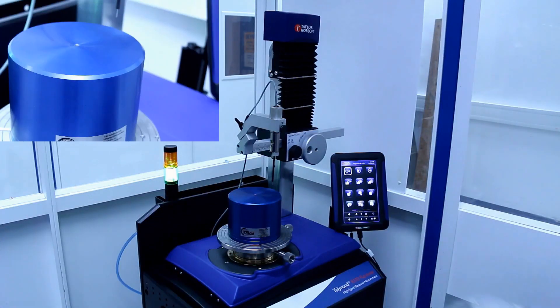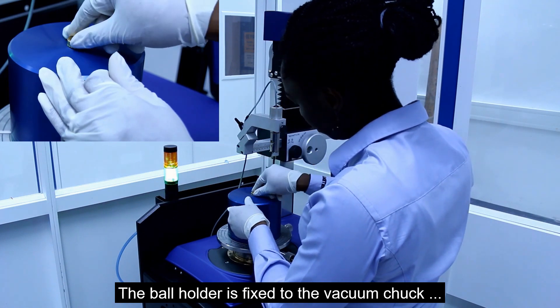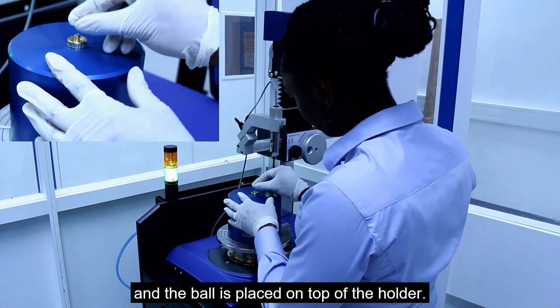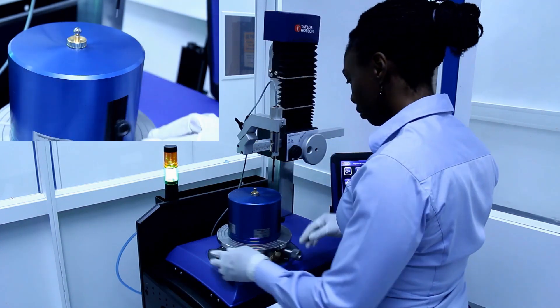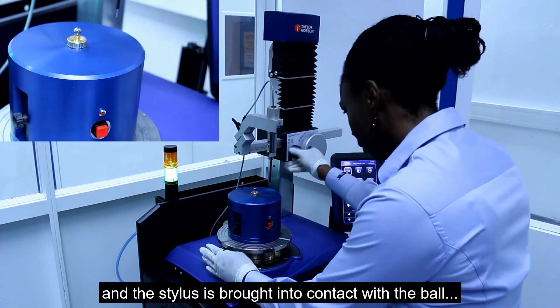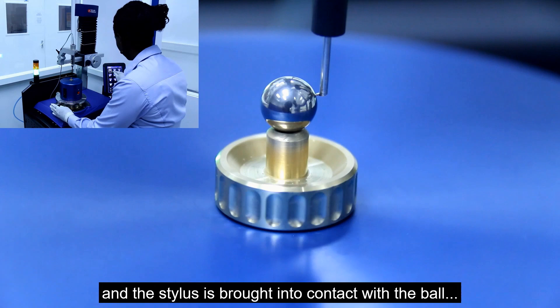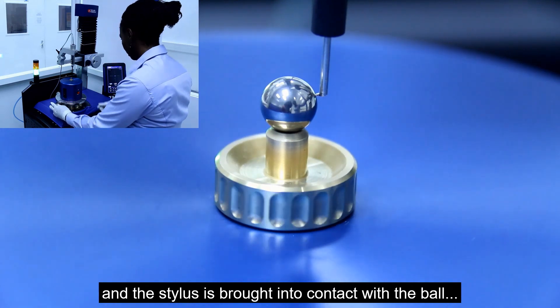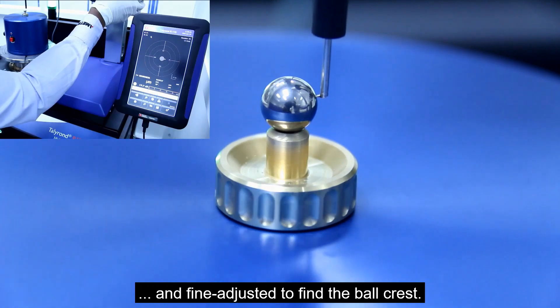The measurement process is as follows. The ball holder is fixed to the vacuum chuck and the ball is placed on top of the holder. The vacuum chuck is switched on and the stylus is brought into contact with the ball and fine adjusted to find the ball crest.